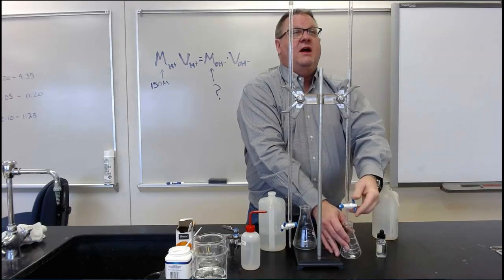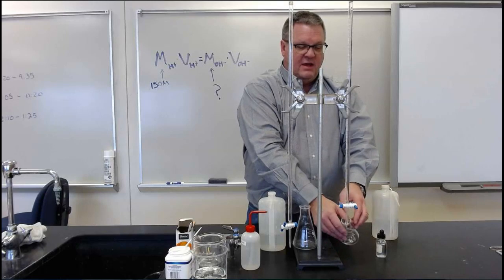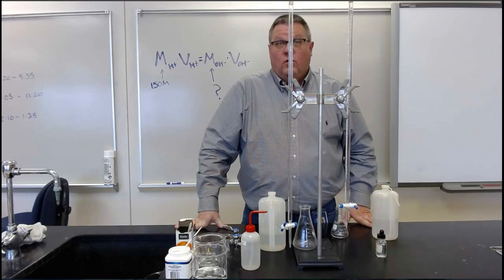I'm going to watch with my eye level on the mark until it gets to 0. I'm going to touch off any drop that's hanging there, and now that's what we call a loaded burette.